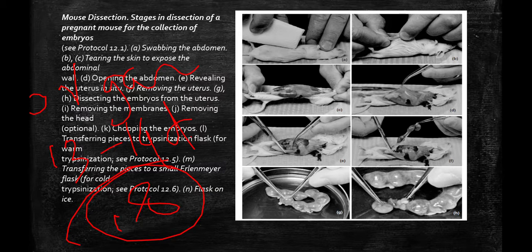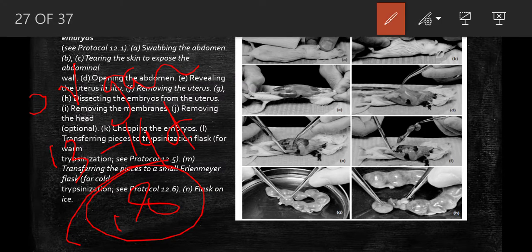Then you tear the ventral skin transversely at the median line over the diaphragm, grasp the skin on both sides and pull it from both directions so the skin is ripped apart, revealing the untouched ventral surface of the abdominal wall.